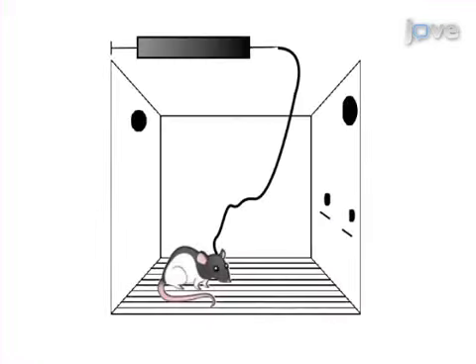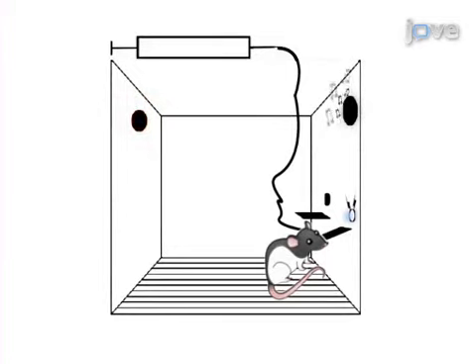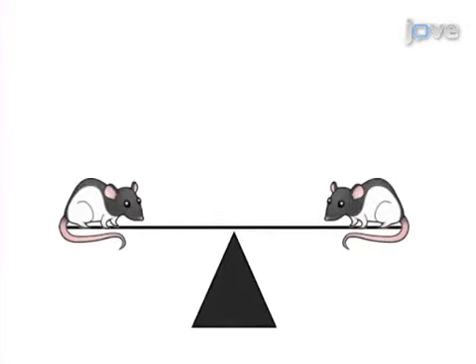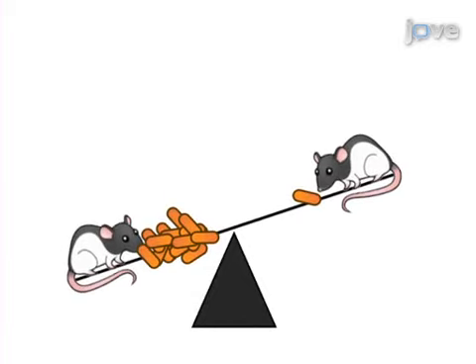Following a recovery period, rats are trained to self-administer heroin in operant conditioning chambers for a period of 10 days. The next step of the procedure is the abstinence phase, where rats are transported to the animal facility and subjected to a period of restricted or unrestricted access to food.